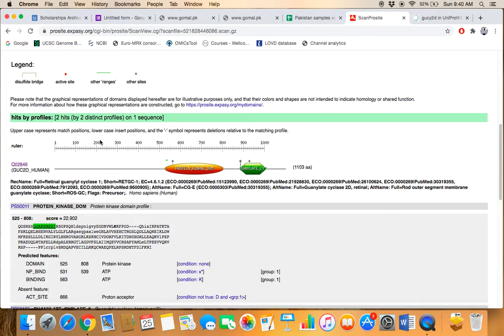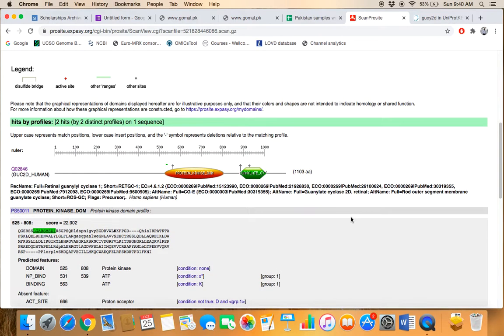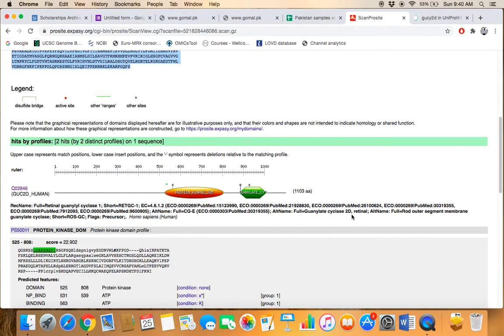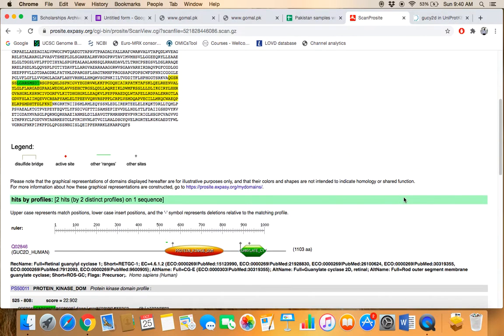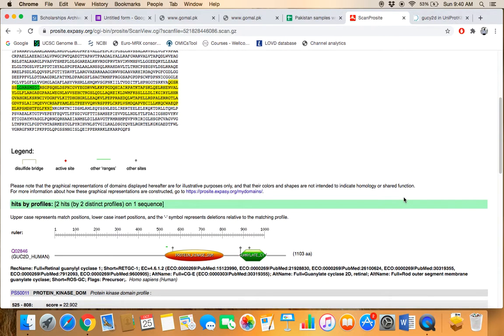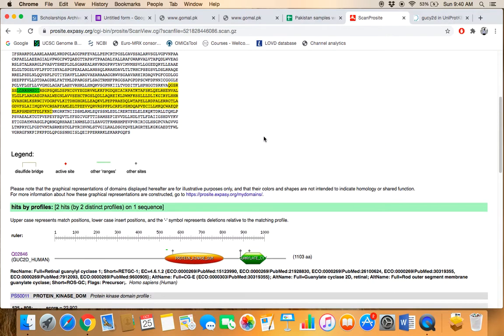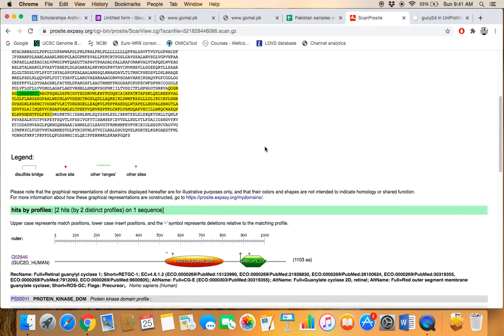Above is present the ruler from where you can assess that this domain number first, protein kinase domain, is physically located from which amino acid till which amino acid. And you can just examine that physically within the primary sequence where does this domain actually located.